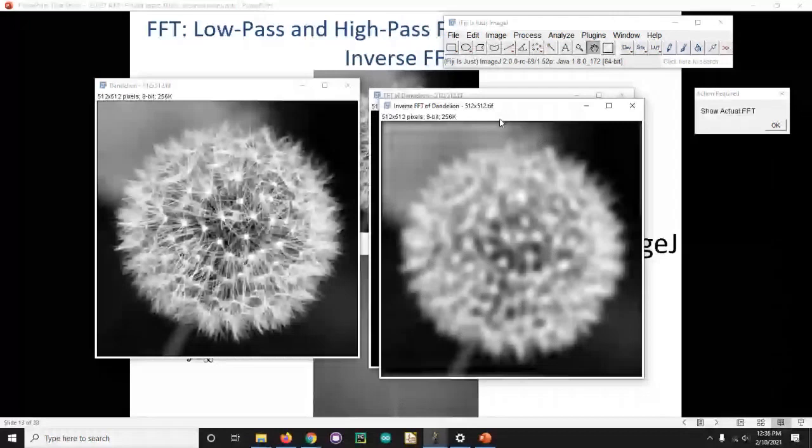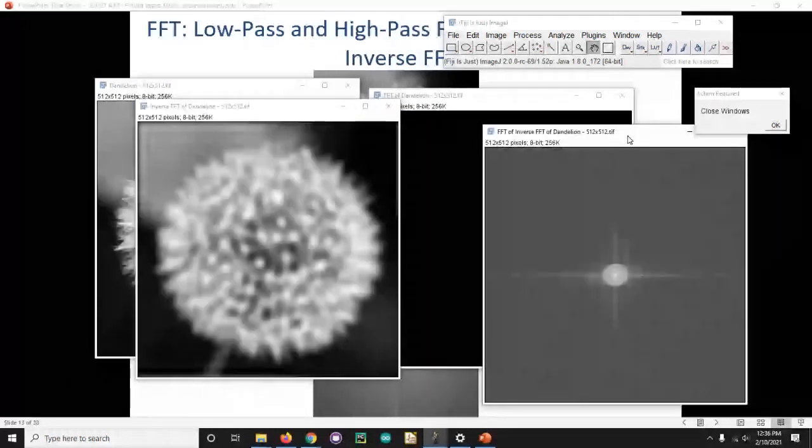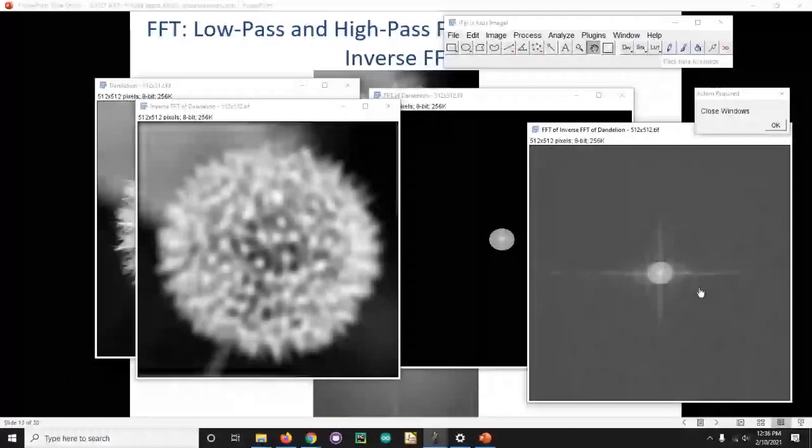If you take the inverse, we can see it's much more effective, because there's no fudging correction that needs to be done, it's a purely smooth image. So you can see we have this nice, perfect pattern of the original Fourier transform, and then it just goes down to our background noise level with the horizontal artifact. That's the edge artifact we talked about before.